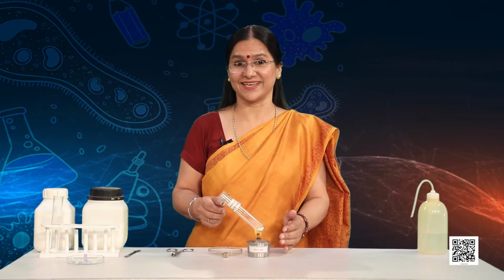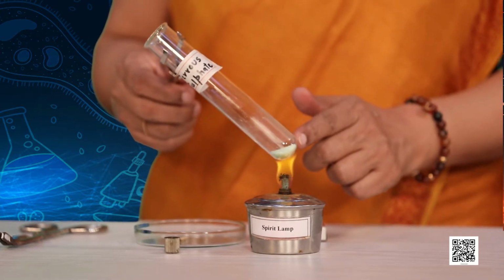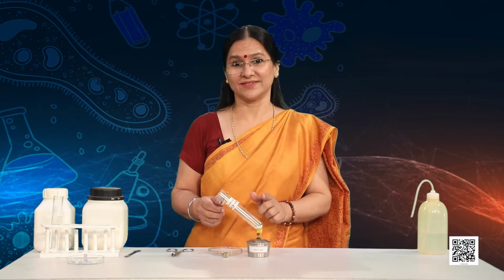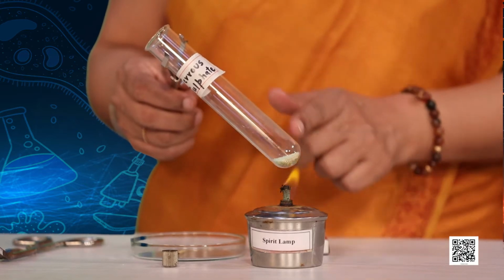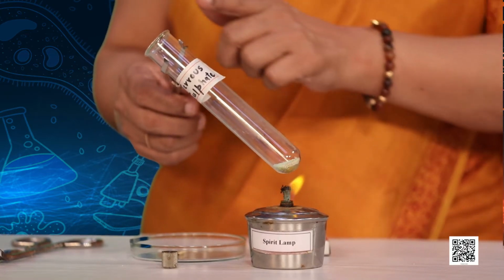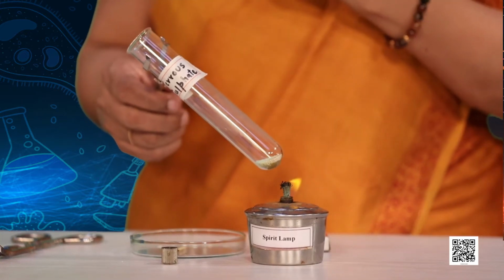Now friends, recharge your observational skills, and while we are heating, observe the change in color of the crystals carefully. And always remember, the correct way of heating the boiling tube is to tilt it at an angle of 45 degrees. And also, never point the mouth of the boiling tube at your neighbors or yourself.